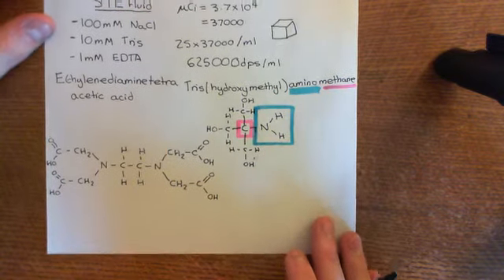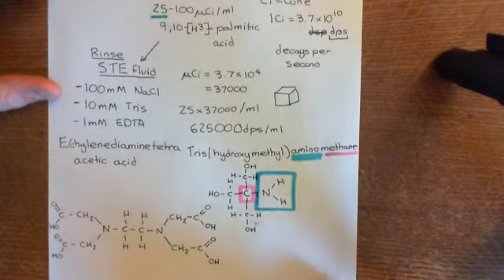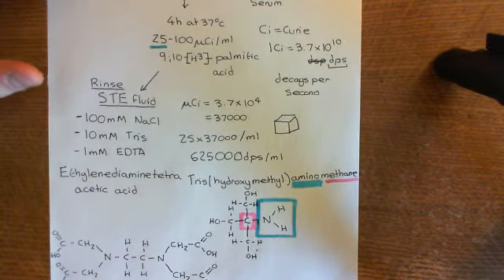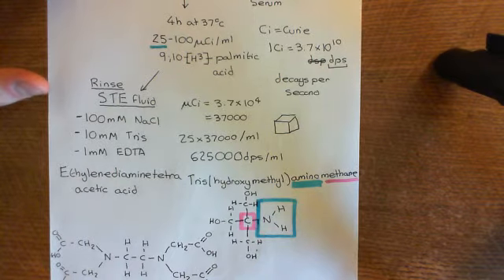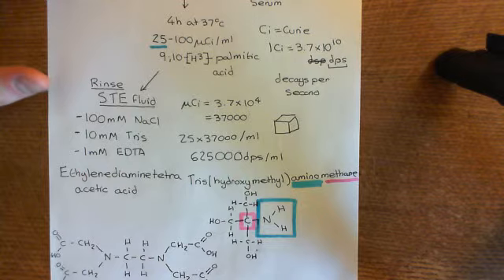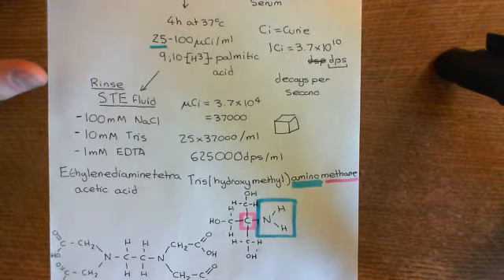Now, before we go on to talk any further, let's think about what this process of adding in the tritiated palmitic acid has done. So our cells were starved, they had run out of palmitic acid. So when you suddenly started giving them this tritiated palmitic acid, they were overjoyed. They said, fantastic, this is what we've been looking for. We've been synthesizing all this protein A because you've put an extra gene into us, and we couldn't palmitoylate it.